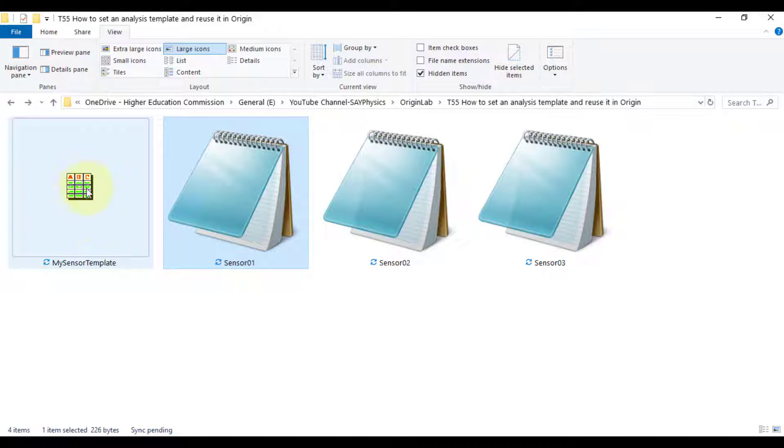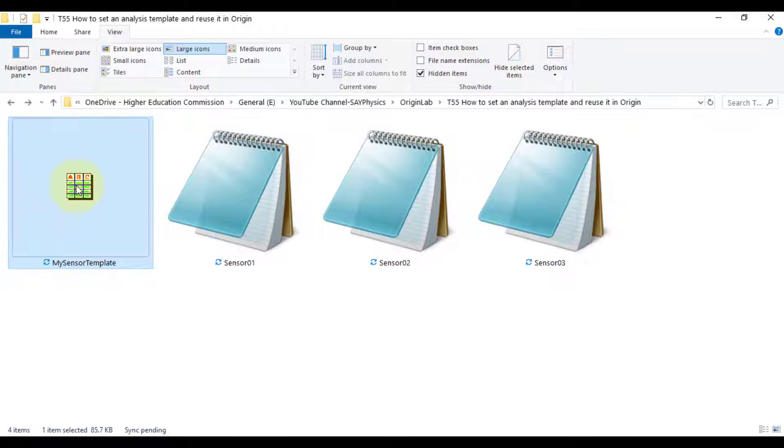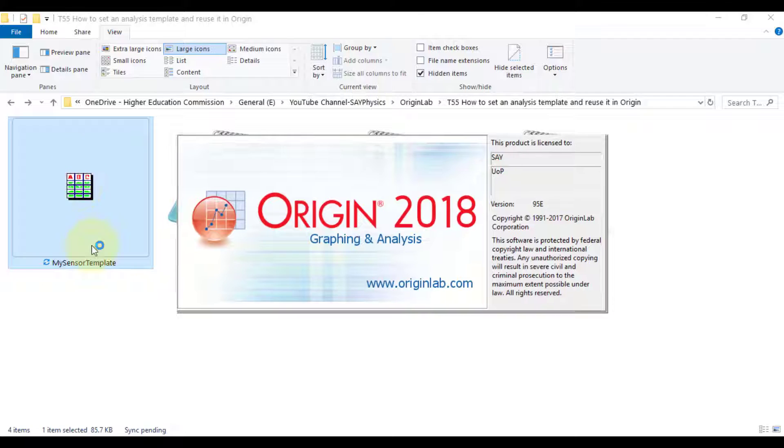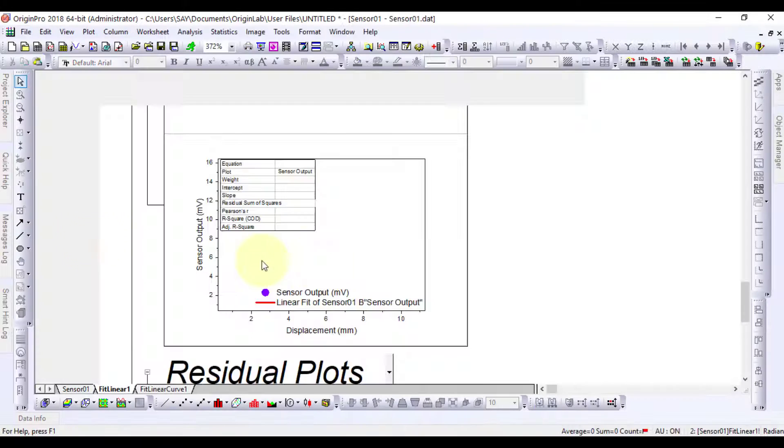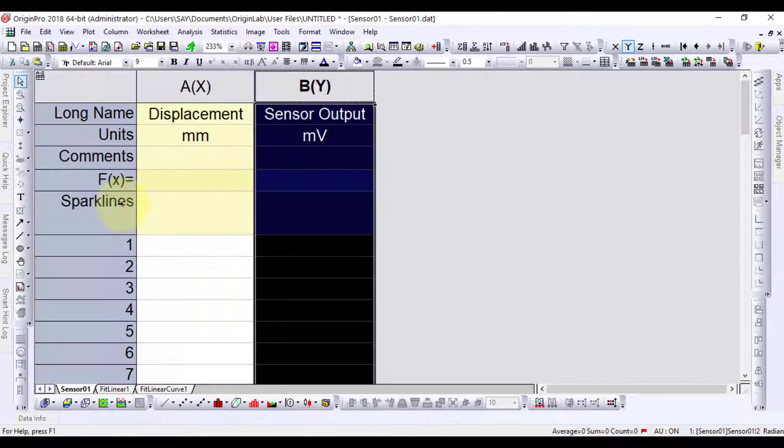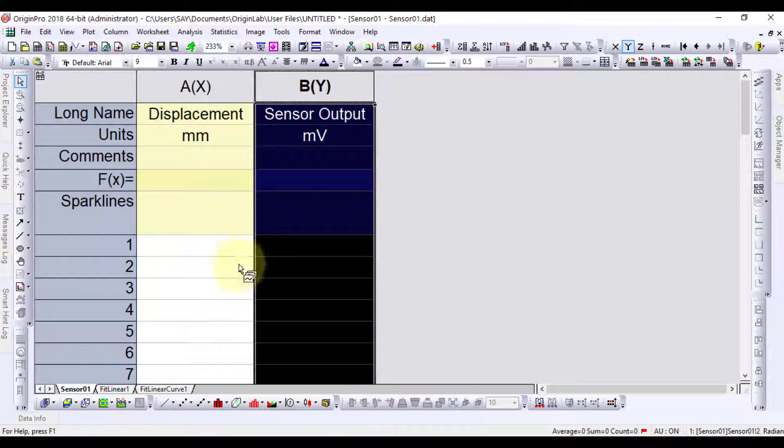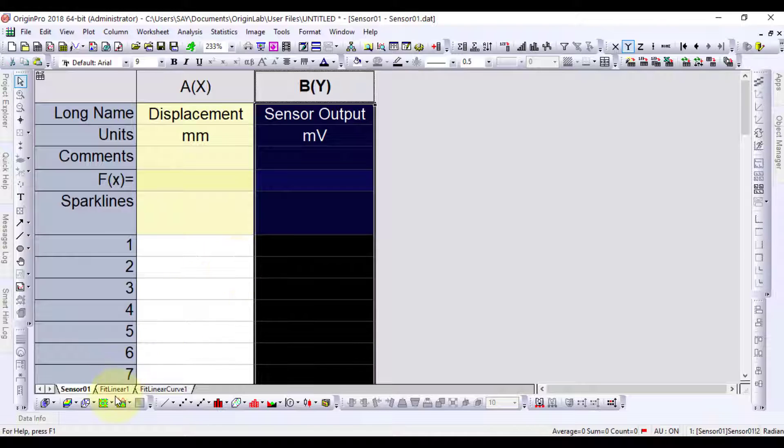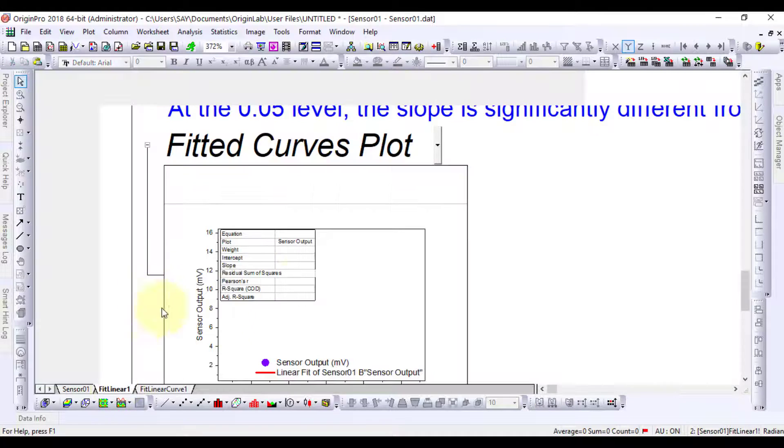This is the analysis template, which we can use for all the data. Let's open it and here we can see that it has no data in it, but all the parameters are set for any imported data.